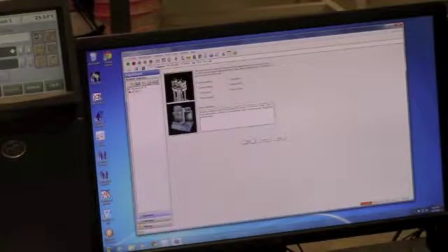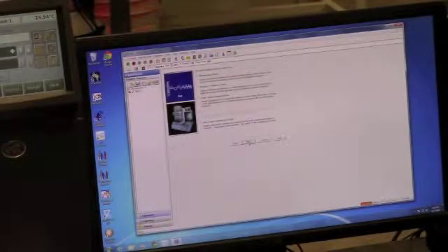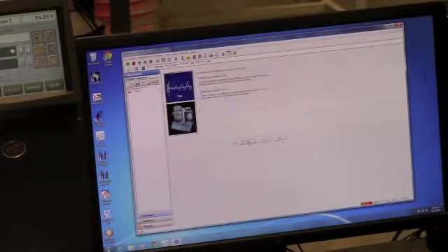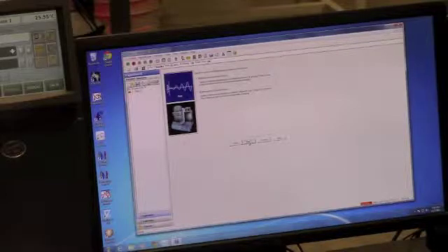This allows you to select what mode to use on the machine, what type of test to run, and what factor levels to use. In addition, this is where sample dimensions can be entered and where the data storage location is selected.